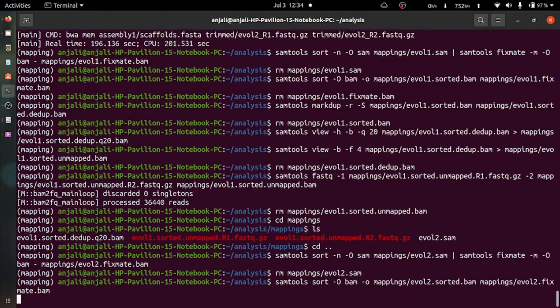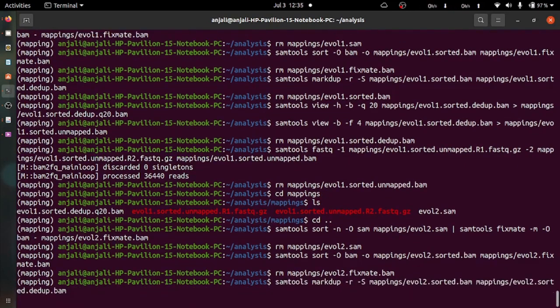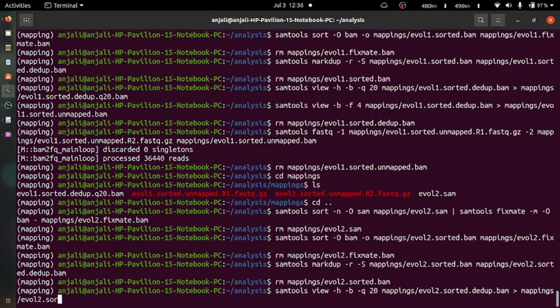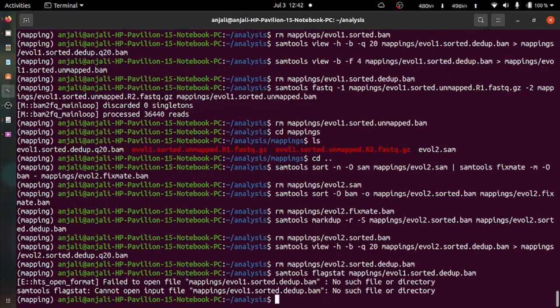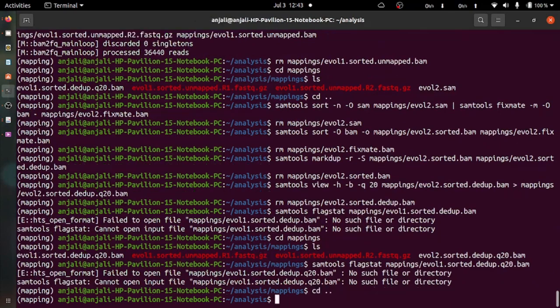Now we will remove duplicate reads. The main purpose of removing duplicates is to mitigate the effects of PCR amplification bias introduced during library construction. This step is not always recommended. It depends on the research question. In SNP calling, it is a good idea to remove duplicates, as the statistics used in the tools that call SNPs subsequently expect this. However, for other research questions that use mapping, like RNA-seq, you might not want to remove duplicates.